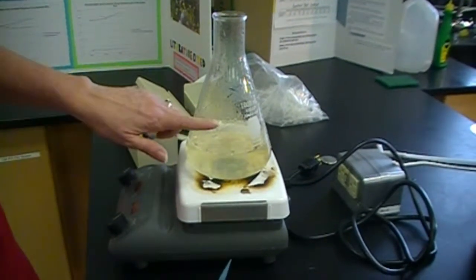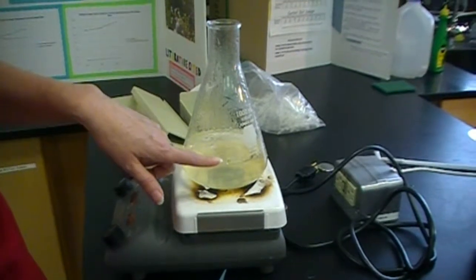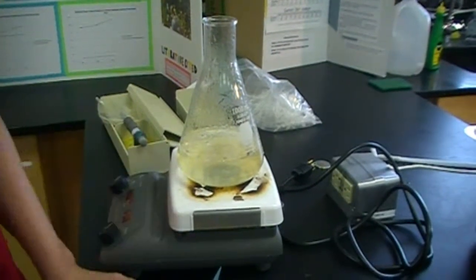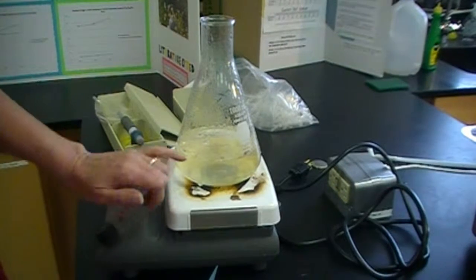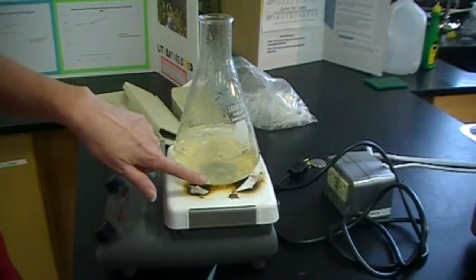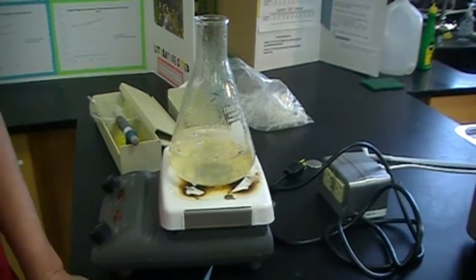So at first, as you can tell, I have an Erlenmeyer flask. I put in 400 mls of distilled water. They give you a little pouch of the NGM agar. I just simply open the pouch, poured it in, and let it come up to boiling.